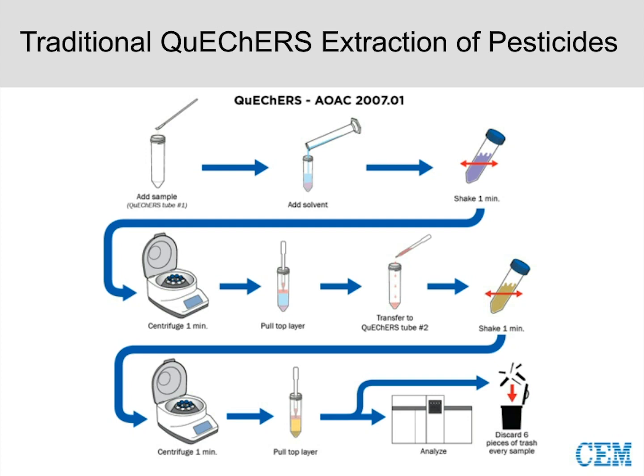The process is very manual. There are a lot of different steps to it, as you can see, and you generate a fair amount of waste throughout that process, too, with the different types of centrifuge tubes you have to use and pipettes and so forth. So again, it's a tedious process that takes a lot of time from the technician that's running this, and can be, at least according to my chemists in our lab, a little bit frustrating to run. So now this is just a standard method.